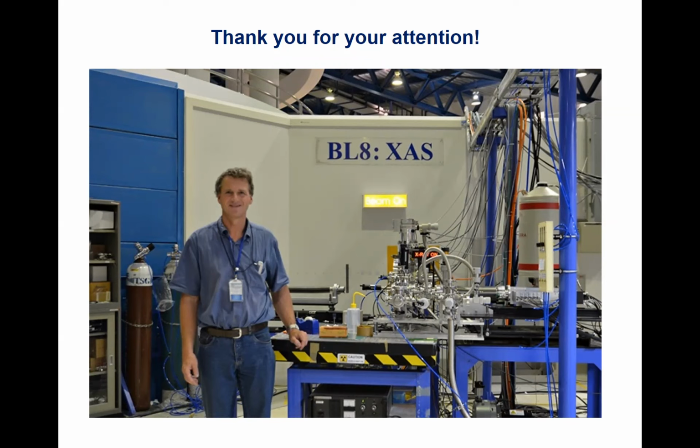And so that's a partial answer, because then it wouldn't be XANES exactly, it would be EXAFS. And whichever package that you might be using, of course, have advantages and disadvantages, but that is one way of solving that problem. Although, of course, it's more labor intensive and it's more beamline intensive. That's what I wanted to suggest.